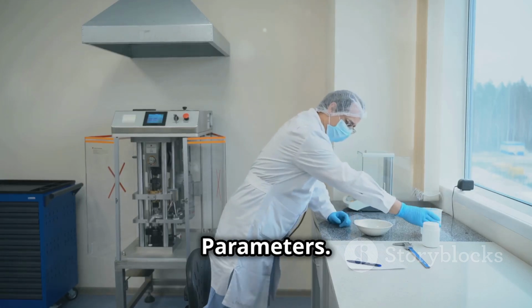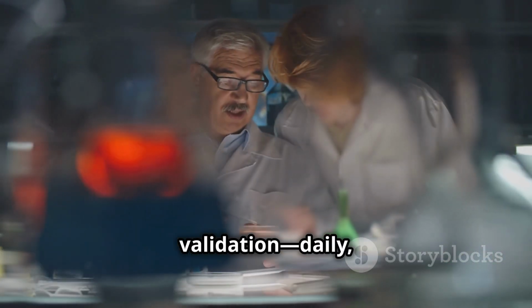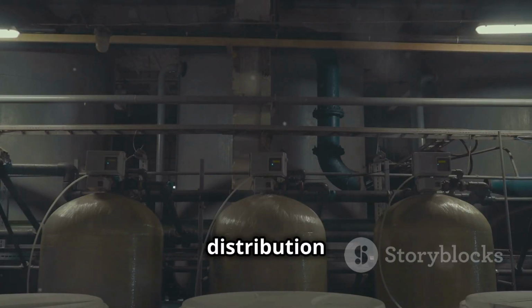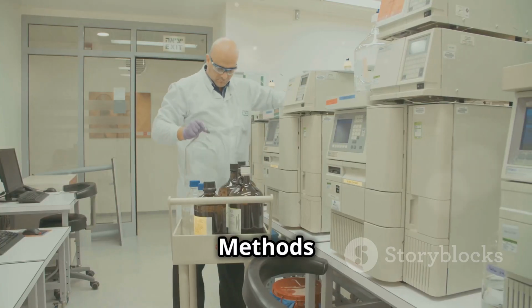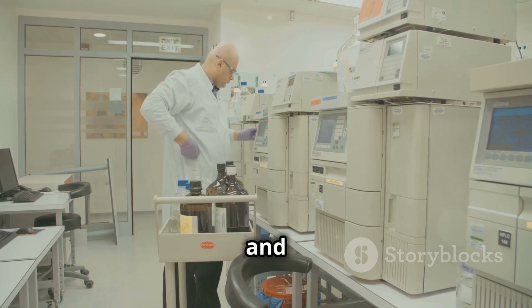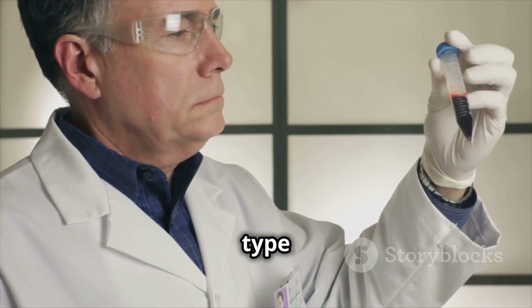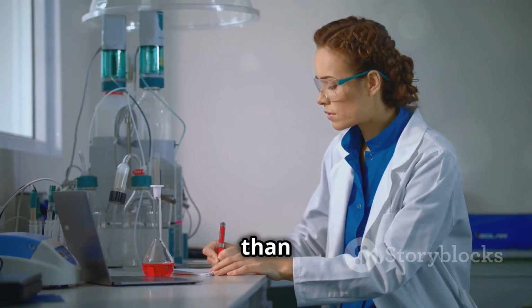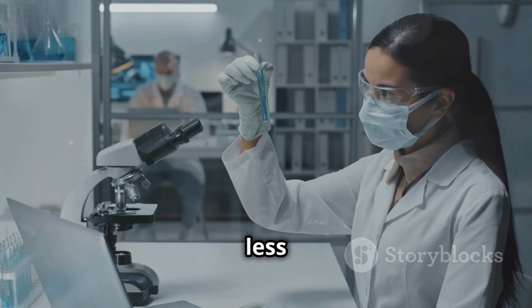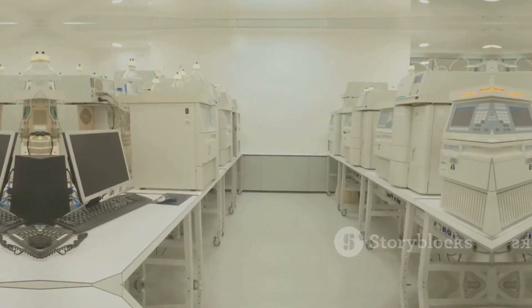Sampling plan and testing parameters. Sampling frequency defined for each phase of validation: daily, bi-weekly, monthly. Sampling points include storage tanks, distribution points and return loops. Testing methods: follow SOPs for microbial, TOC, conductivity, endotoxin and temperature testing. Acceptance criteria: specifications for each type of water, for example, conductivity less than 1.3 microsiemens per centimeter for PW, endotoxins less than 0.25 EU per milliliter for WFI.